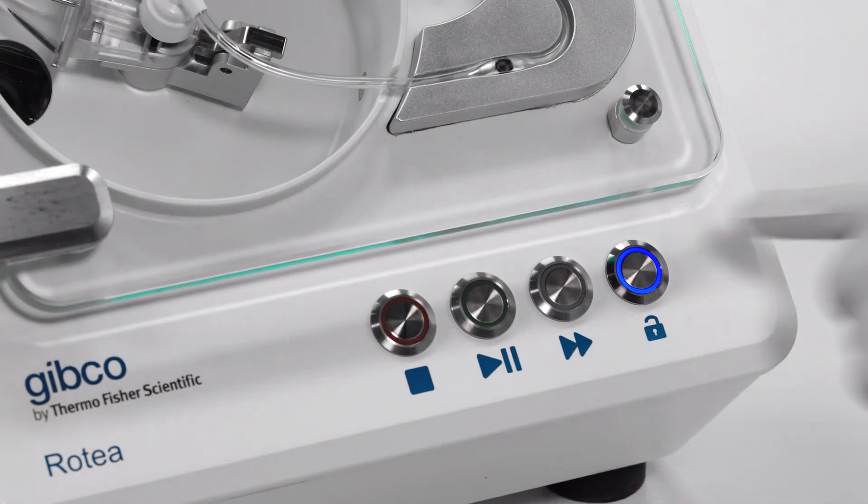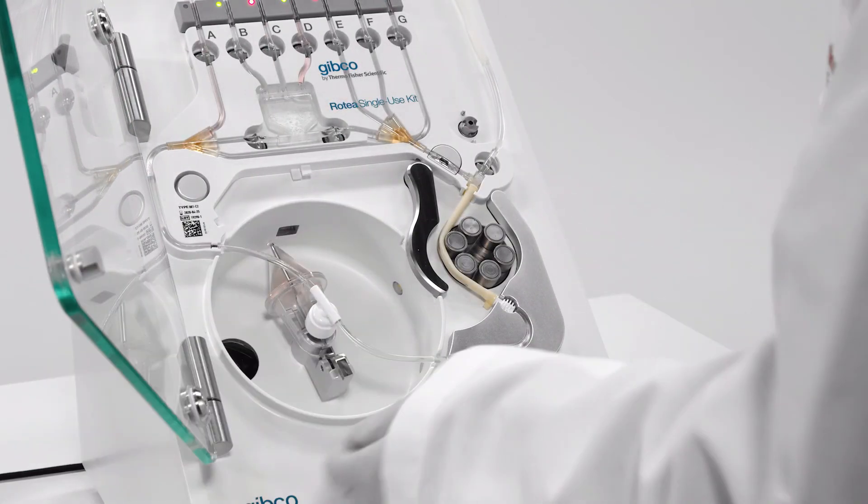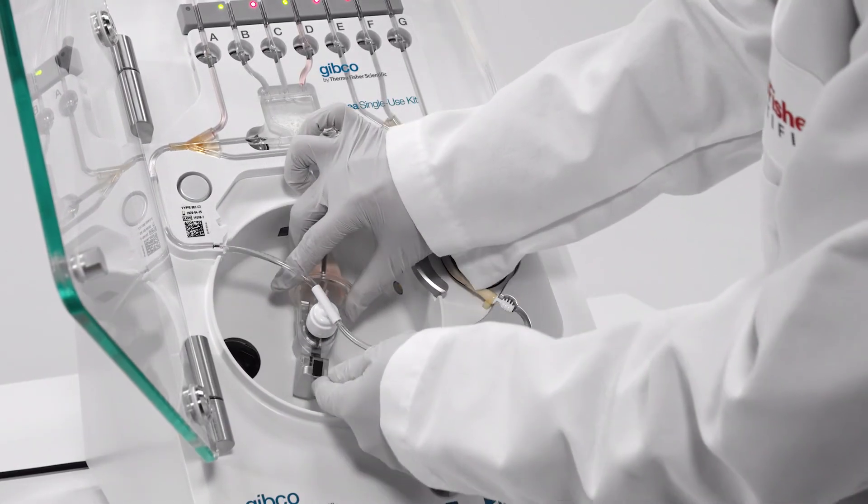Hit the unlock button on the instrument and open the door to access the cone. Then, detach the cone again using the lever.